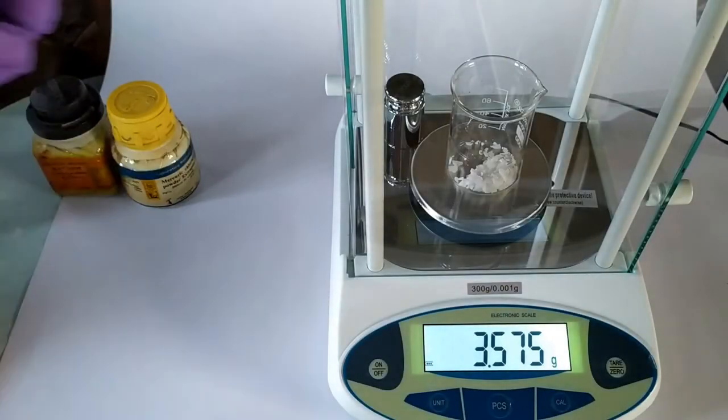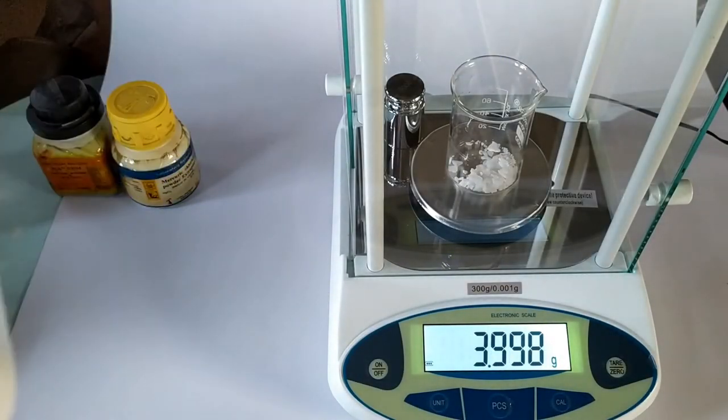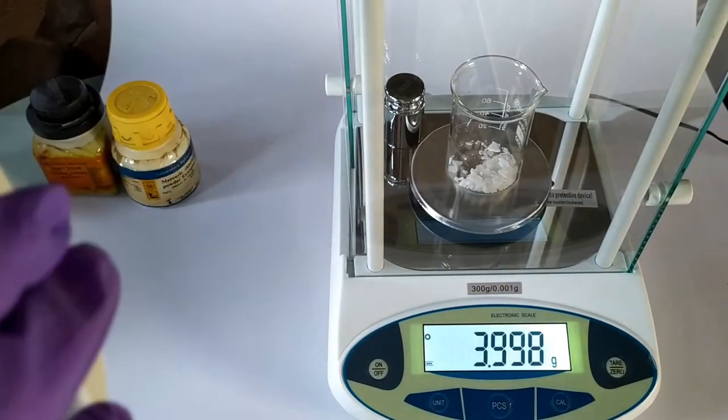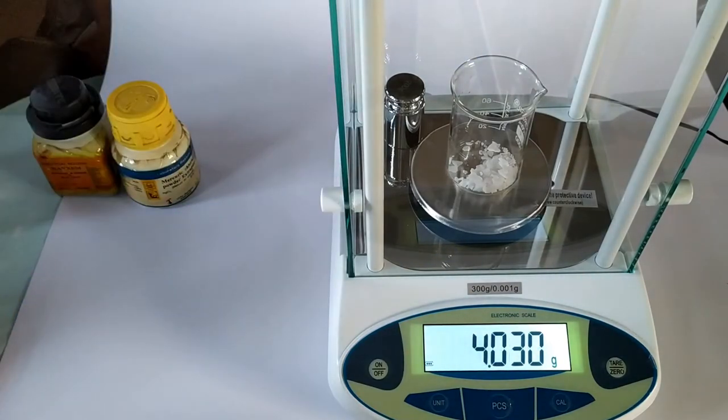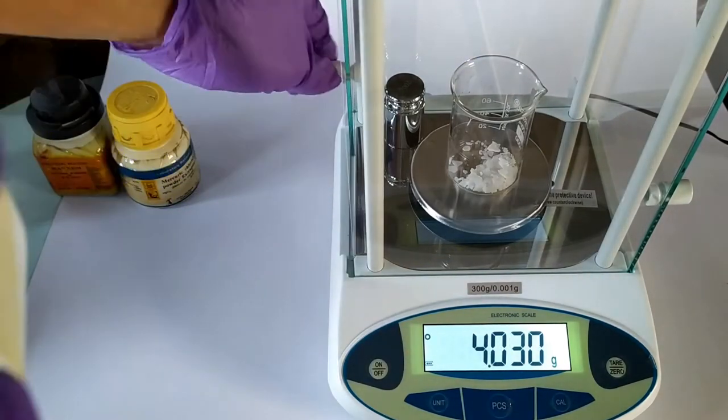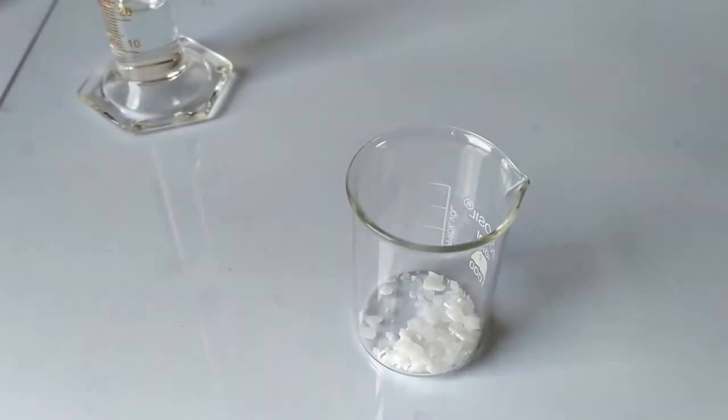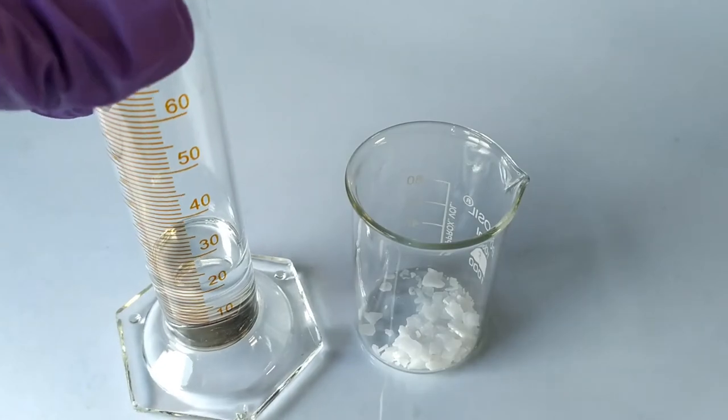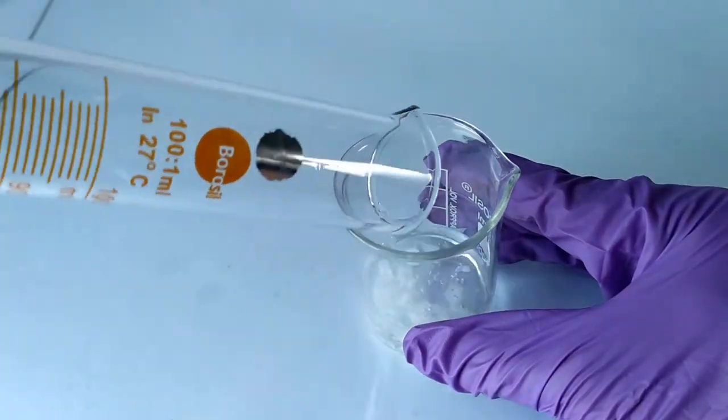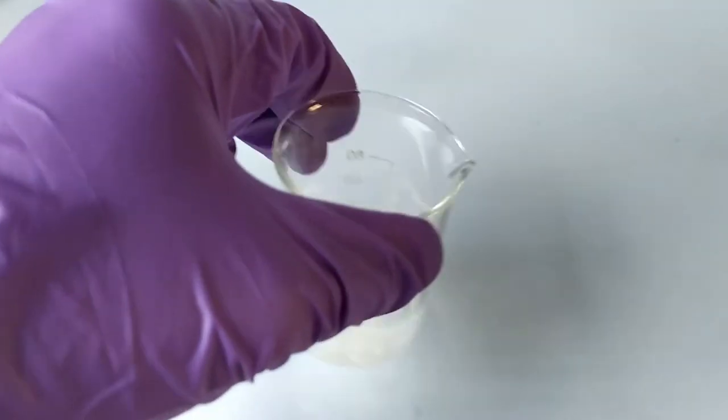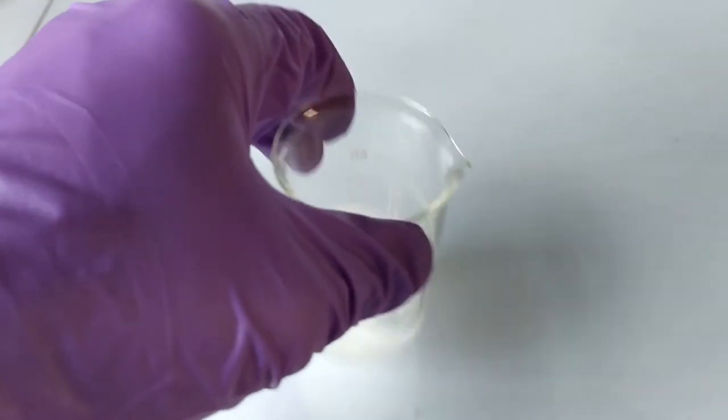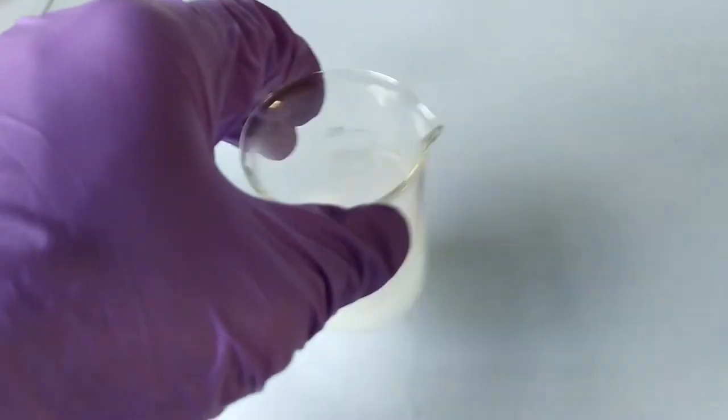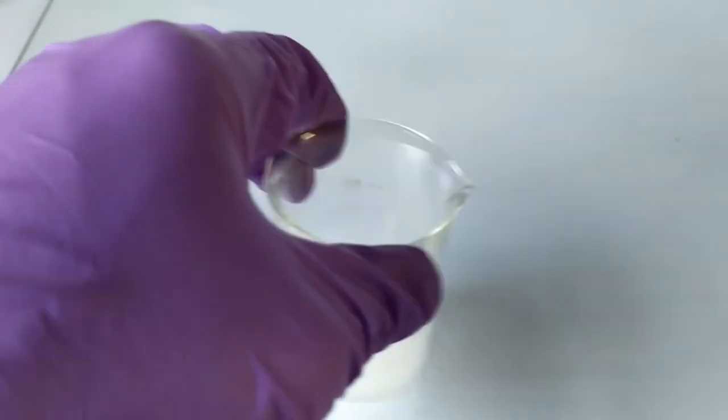Now weigh 4 grams of sodium hydroxide in the third beaker. Dissolve it in about 20 to 30 ml of distilled water. Allow it to cool to room temperature. Alternatively, you can directly use 20 ml of 5 molar or 5 normal sodium hydroxide solution. It's the same either way. Also keep this beaker aside.